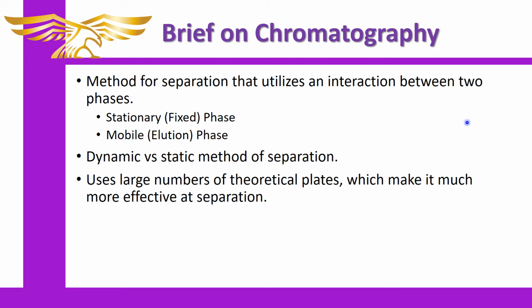Chromatography in the briefest sense is a separation method. It's more powerful than the standard separations that you've done in the lab so far that were based more on density than anything else, or based on reactive solvents and then using density afterward. The big difference here is the fact that it's more dynamic and that there's usually a fixed or stationary phase, which can also be called media or chromatography media. It depends on the type of chromatography you're using.